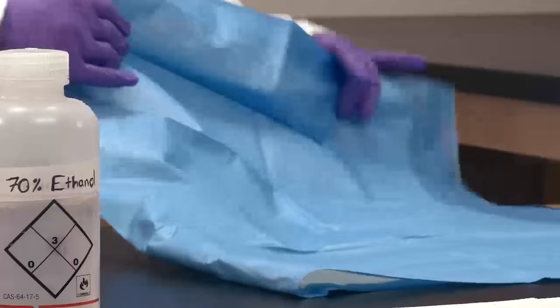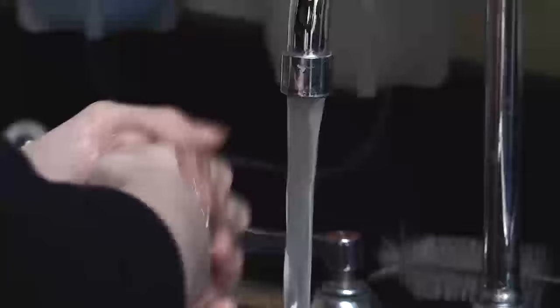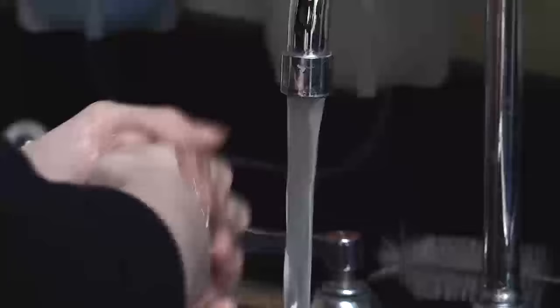At the end of each lab session, place all cultures and materials in the proper disposal area. Clean the bench top with the provided solution. The last thing to do when you leave the lab is to wash your hands. That's the last and most important thing in this video.